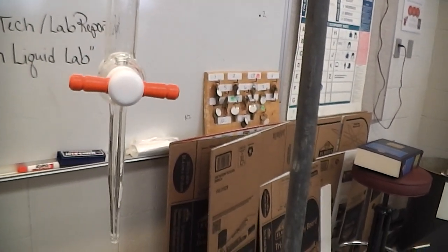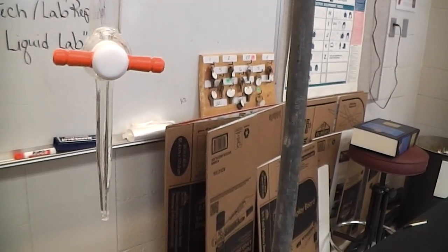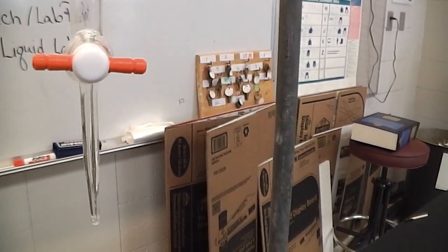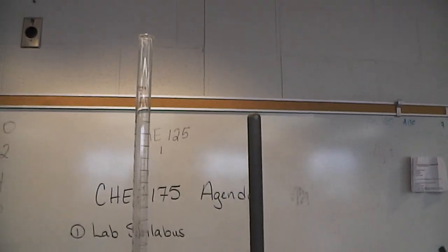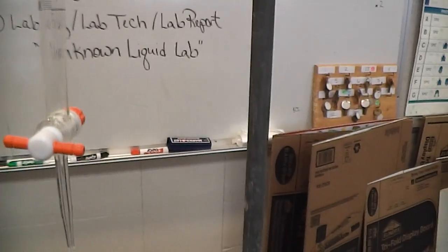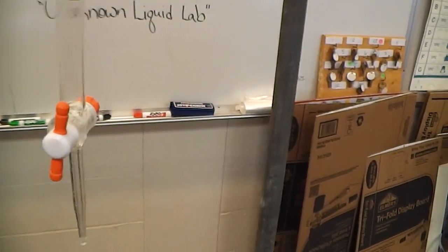Oops, there it is. A spigot on the end of it. Okay, when the spigot is perpendicular, that means it's closed. So if we pour liquid into the top of the burette, nothing will come out. If we turn it parallel, then the liquid is free to flow out.